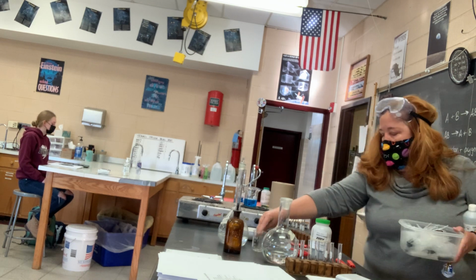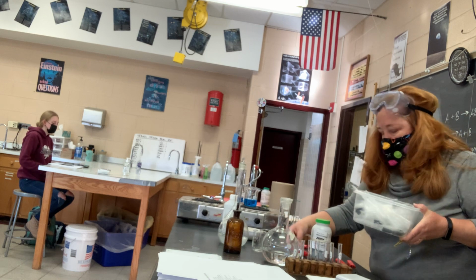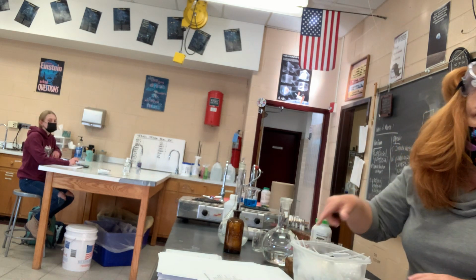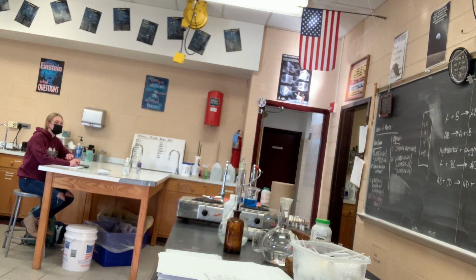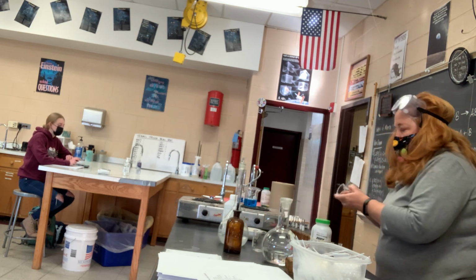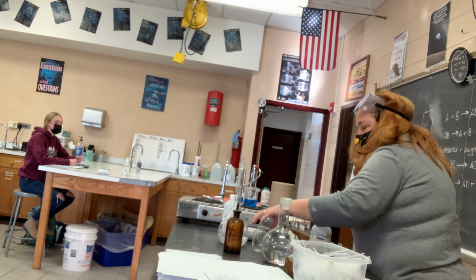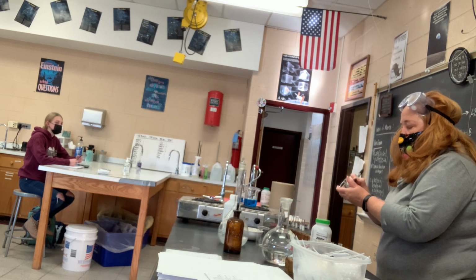Pre-made salt water. So this is hydrochloric acid. I don't really want the copper sulfate to boil. This is salt. This is silver nitrate.